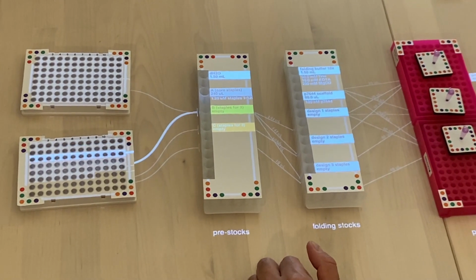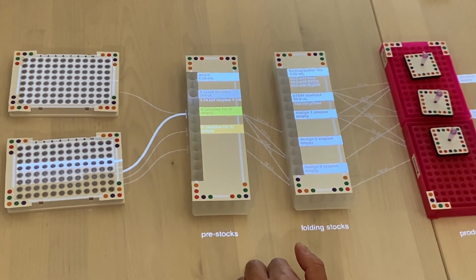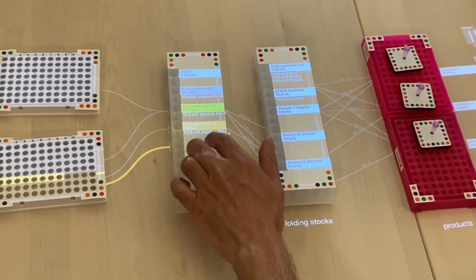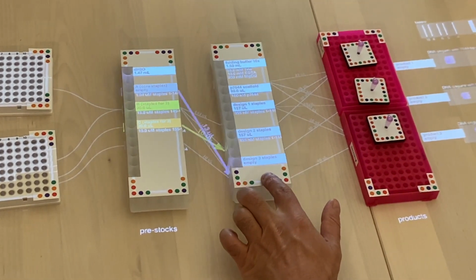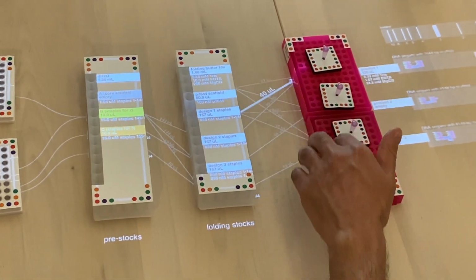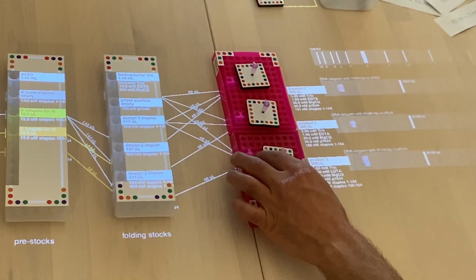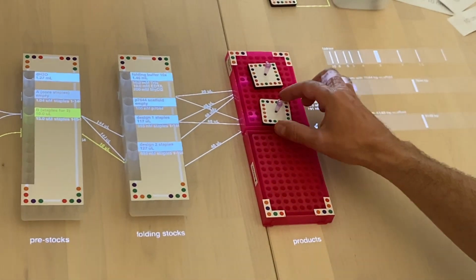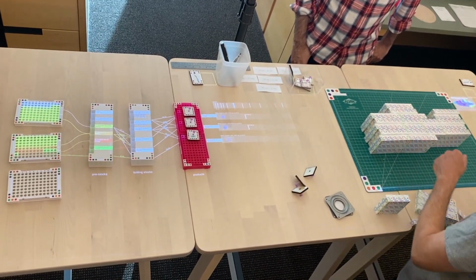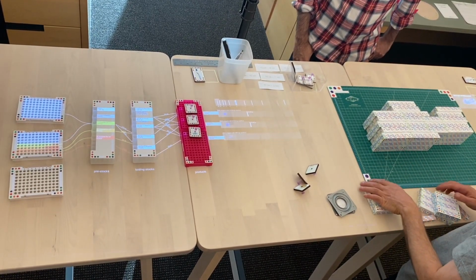This is exactly the same setup we'll be using for real when we get to the wet lab a bit later, but now we're simulating it. I'm going through the protocol step by step to preview each pipette transfer. And we see at each step the contents of the tube and their concentrations. And this is all live. As we rearrange the rack, we get a new protocol. Here we're rearranging the origami blocks and seeing the staples and protocol update immediately.